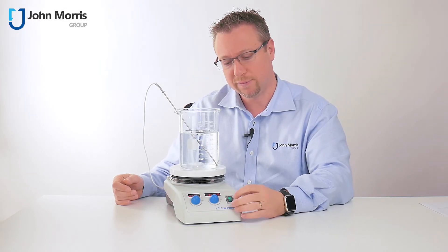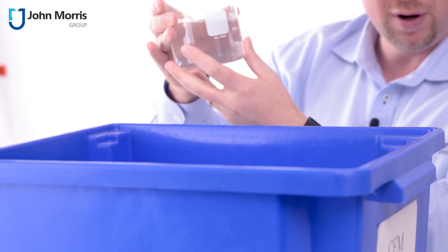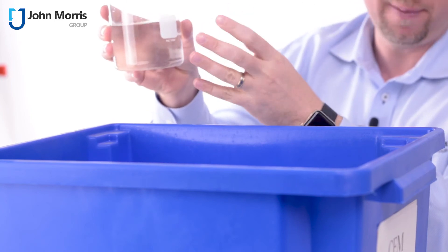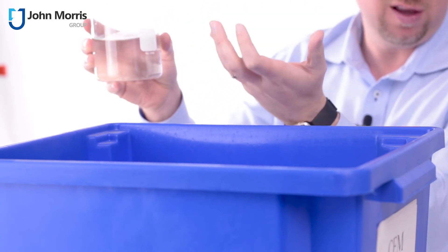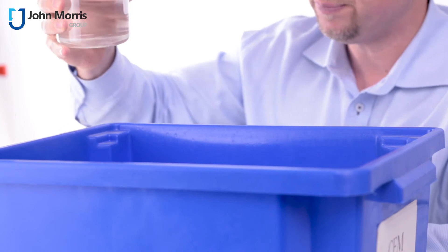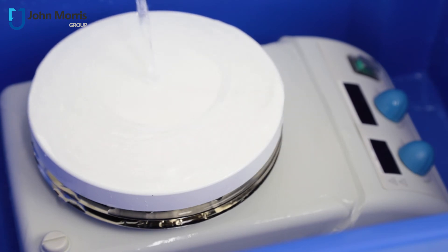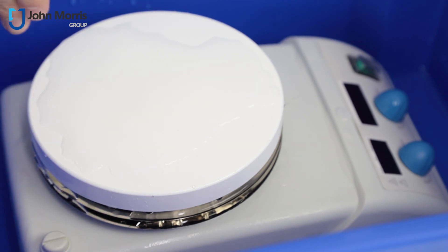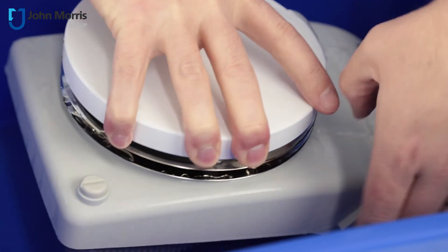Let's do a deluge test and see how we go. What I've got here is about 300 milliliters of water, and I'm going to pour this over the top of the hotplate magnetic stirrer just to show you how it actually goes. This can actually happen because if a flea runs away, it can come through the side of your flask, and if that breaks, your hotplate magnetic stirrer can get deluged. I can hear every lab manager out there cringing. Now this is not a normal situation because the water can't run away in this instance — the water's got nowhere to go, it's contained within a bucket. So let's take it out and see how we went.